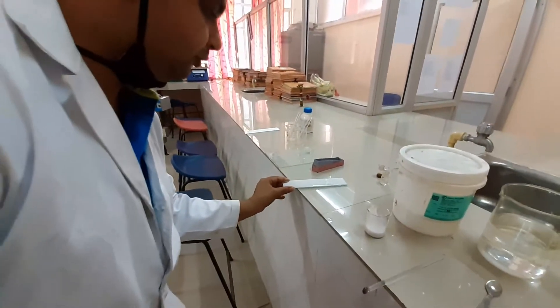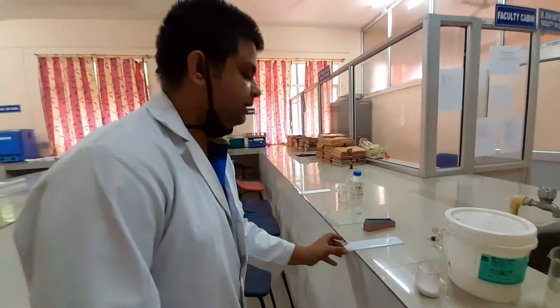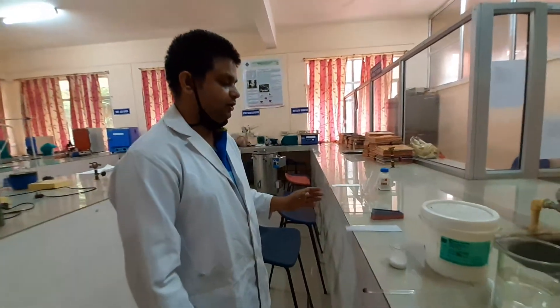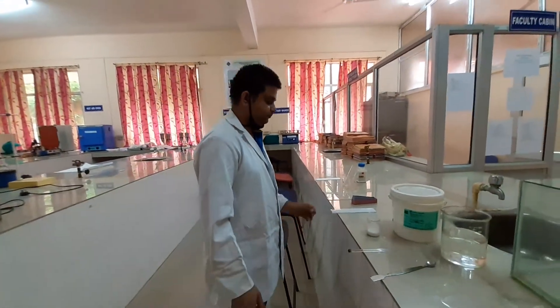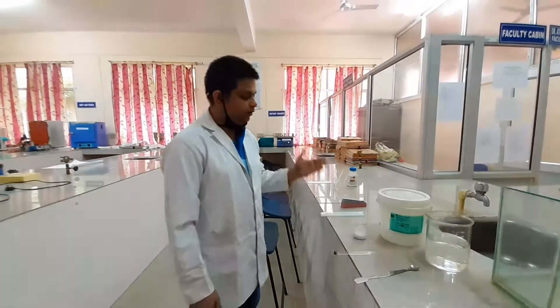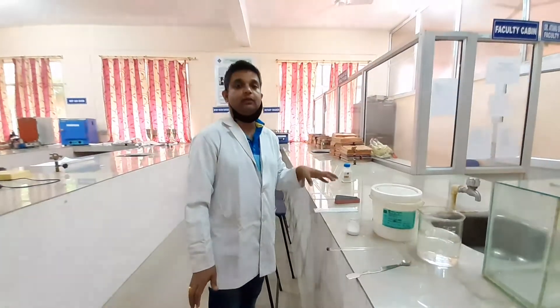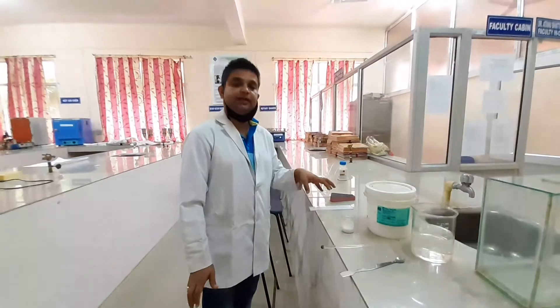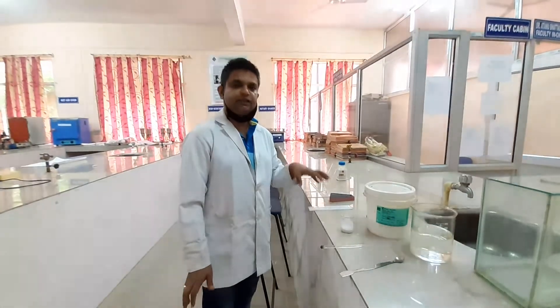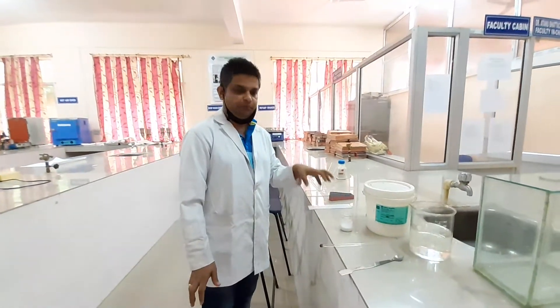We are keeping it for drying. Let it stabilize for some time, then we will keep it inside the hot air oven. Keeping it in the hot air oven at 110 degrees centigrade for at least half an hour, all the water present will evaporate and the silica gel will be activated. Remember, my dear students, this activation of the plate is very important to obtain a proper result.